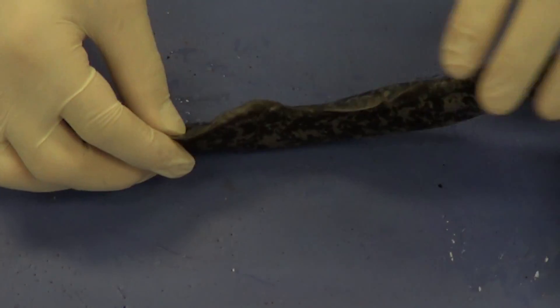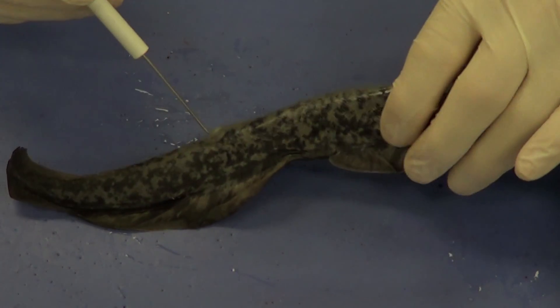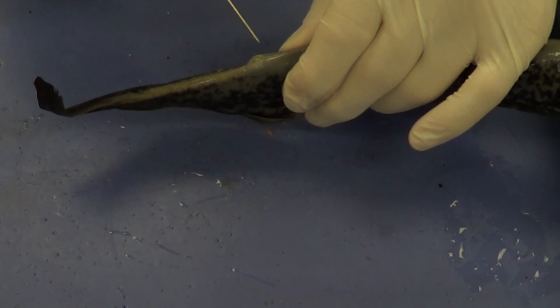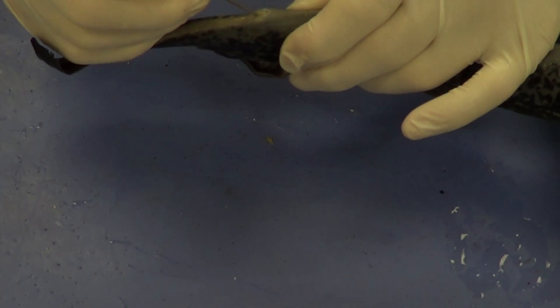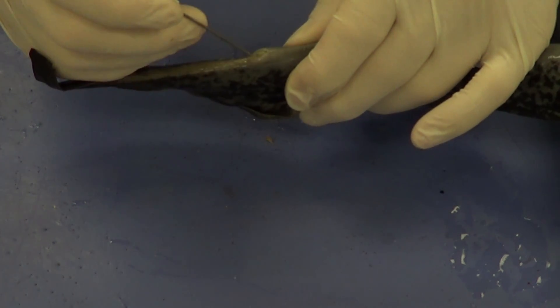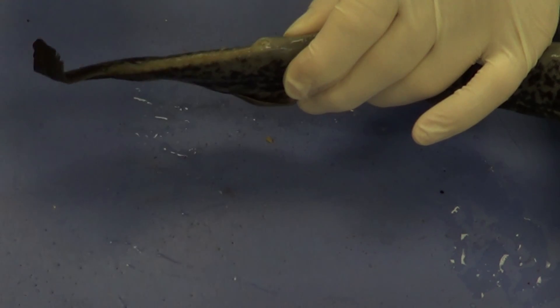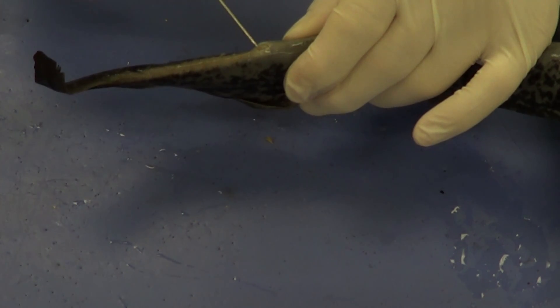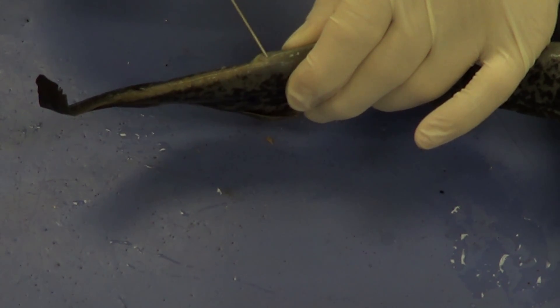One more thing — this is the posterior dorsal fin. Just ventral to it, there's an opening that has basically two openings. The more anterior one is going to be the anus, and the more posterior opening is going to be the cloaca. The cloaca is basically the combined opening for the urinary tract and the reproductive system — that's where eggs or sperm and the different reproductive fluids come out, as well as the nitrogenous and metabolic waste. And just anterior to that, we have our anus.